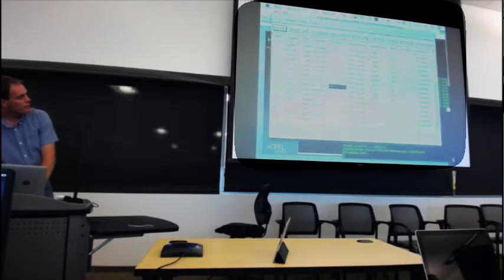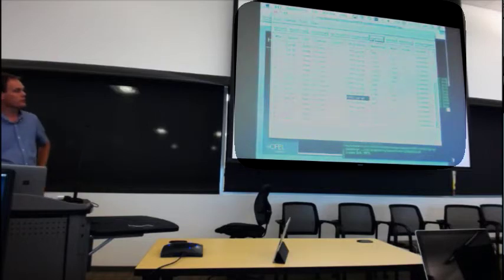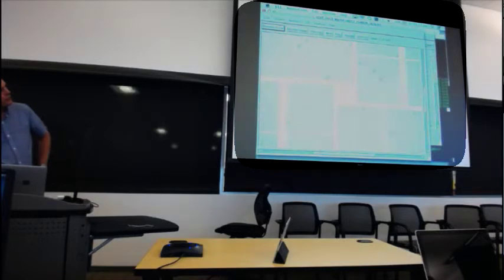Okay, let's skip ahead and show you some other things. Let's say you want to have a look at the data from this one. You just go up here, view hits, click on that button. For most of you, that won't work until you've actually generated some hits, so I'll run ahead and show you what it is. It comes up with the GUI, and you click on default crystal display settings, which circles the peaks. This is the problem with running X11. It looks like that, with the peaks that Cheetah has found circled in this way.